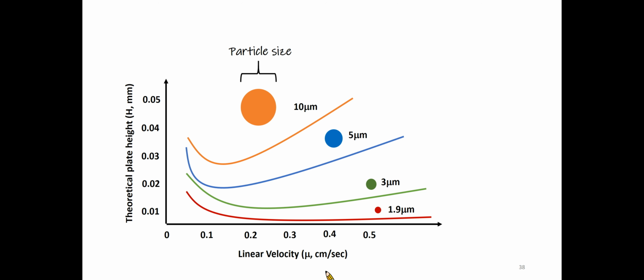This figure shows the Van Deemter plots for various particle sizes. As the particle size decreases, the curve becomes flatter or less affected by higher column flow rates. Smaller particle size yields better overall efficiency or less peak dispersion across a much wider range of usable flow rates.